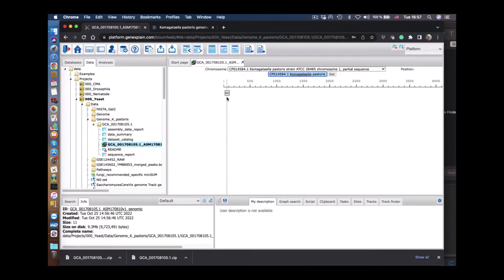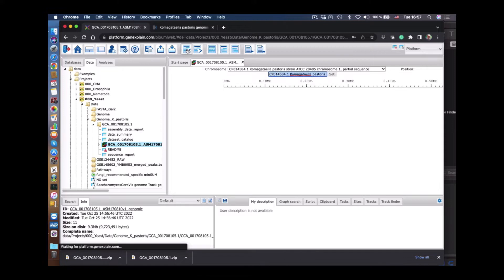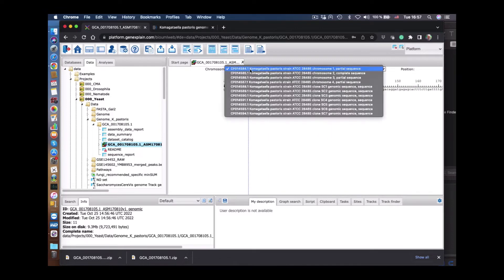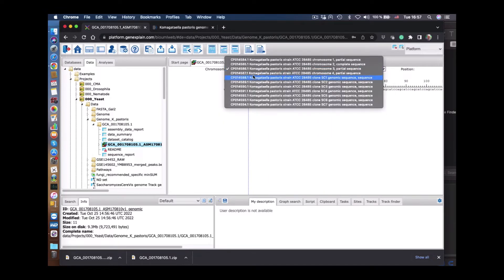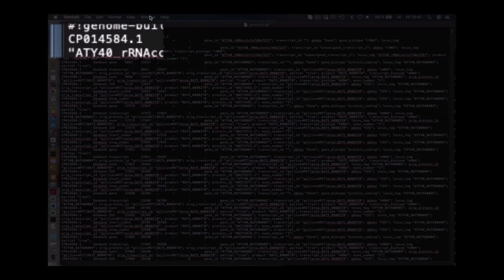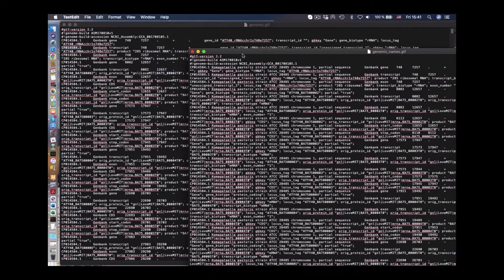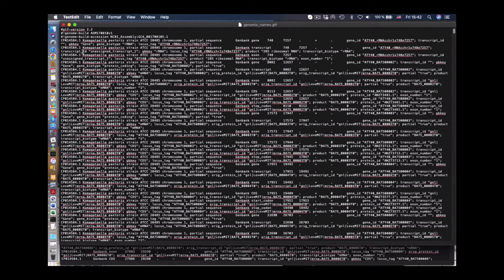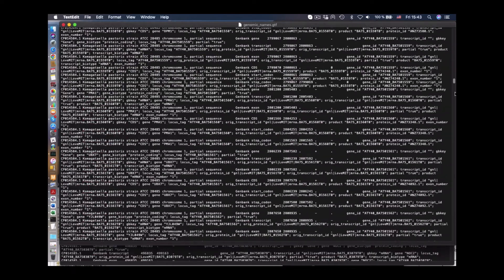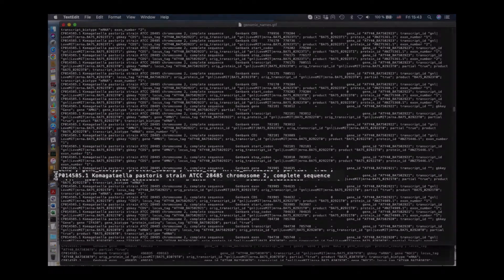We can open that genome and we can see — zoom in, zoom out — and we can switch to different chromosomes. There are four chromosomes we can switch between. Now let's download the gene annotation. The gene annotation is in the GTF file, and it's important to make sure that the names of the chromosomes are exactly the same as they are in the FASTA file. We have to substitute in that file the chromosome names for the full name as it is present in the FASTA file.